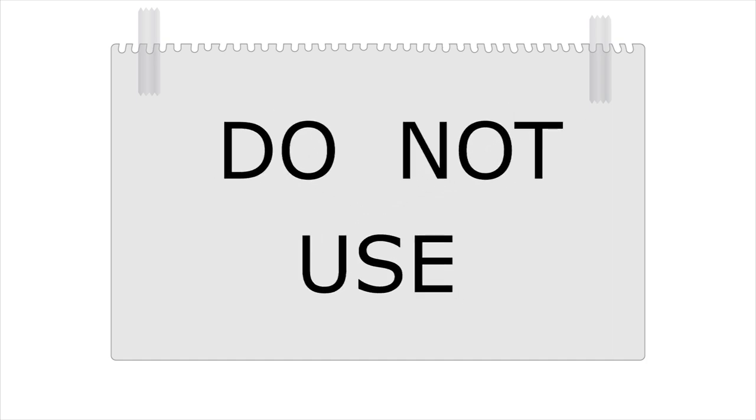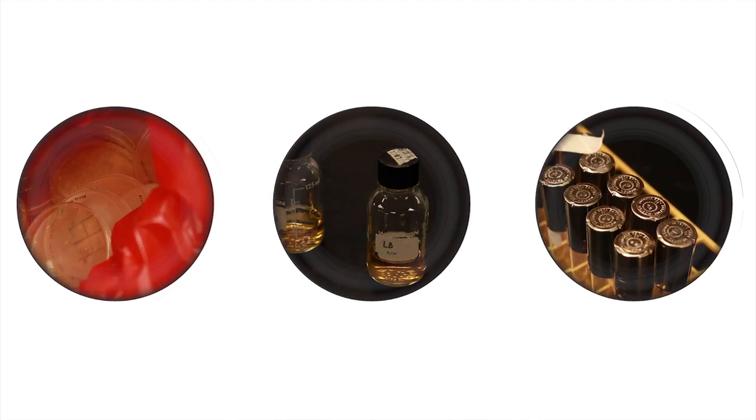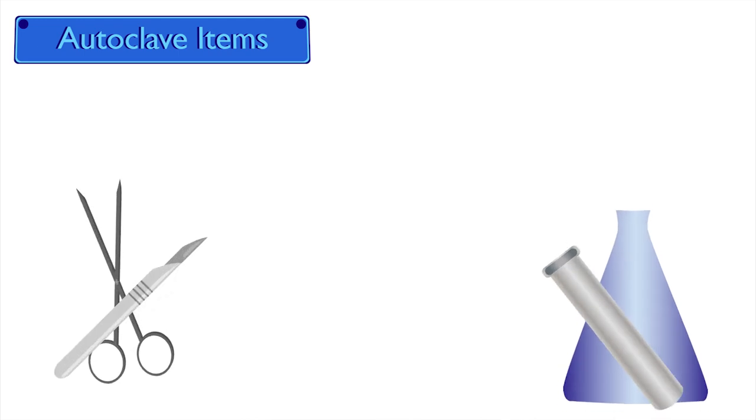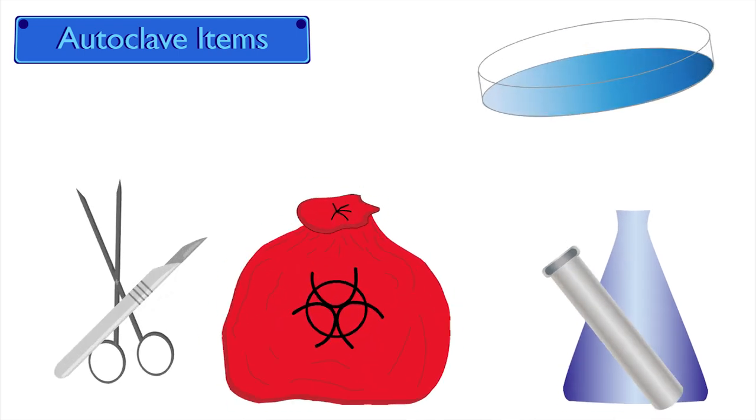You should also post a sign on the autoclave that states, Do not use, to ensure no one else uses the autoclave until the unit is working properly. Second, prepare materials. Typical items that can be put into an autoclave include glassware, dry items or instruments, solutions and media, and biological or potentially biohazardous materials.